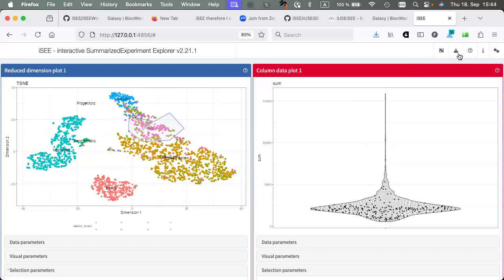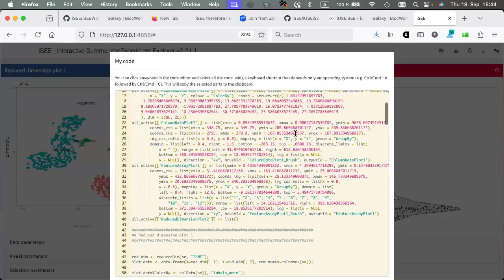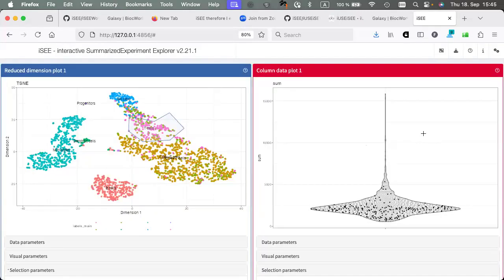And in case you wonder, is the code also mirroring those? Yes, it is, because it kind of saves the polygon for you. Nice. I'm gonna go star your repo right now. Thank you. The cheap way of actually winning stars.